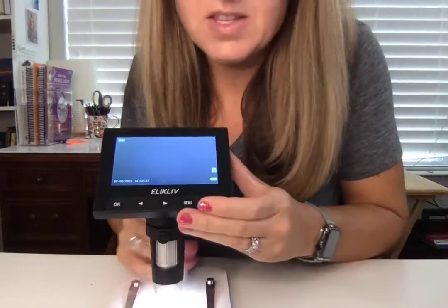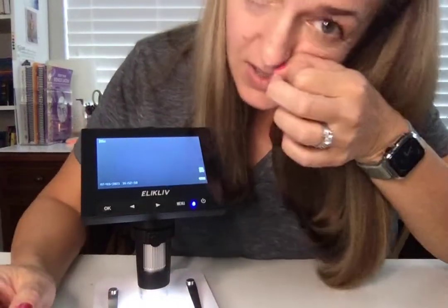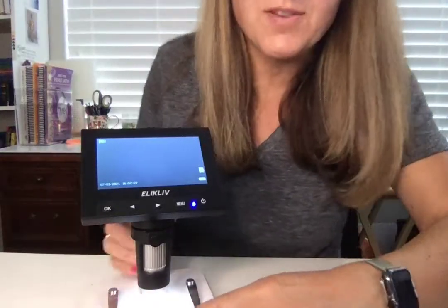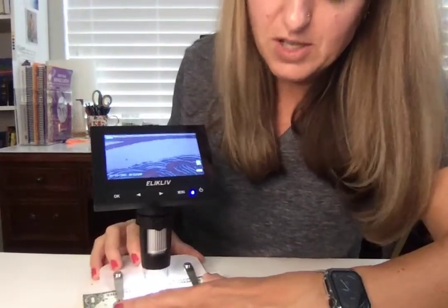It's rechargeable, and this screen is so great — especially for kids, they don't have to get their eyeballs just right. So let's look at something. I've got a dollar bill here because it's really fun to look at up close. It has these little arms that help hold down the thing you're looking at.